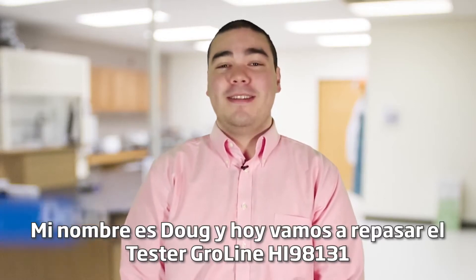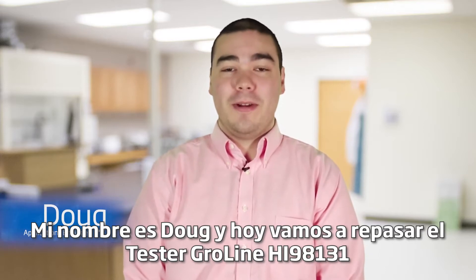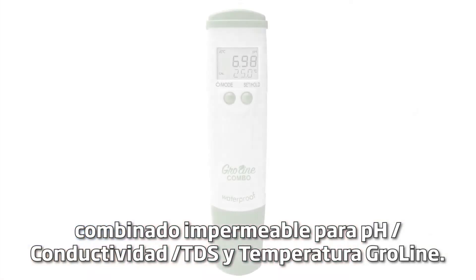Welcome to the HANA Lab. My name is Doug and today we're going to go over the waterproof GroLine HI98131 combo pH, conductivity, and TDS temperature tester.